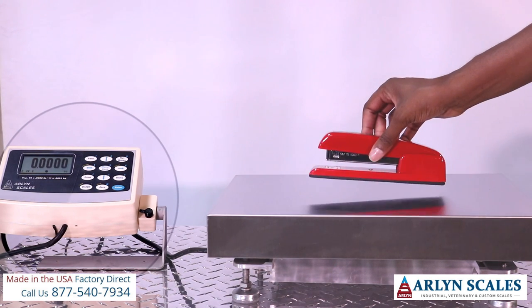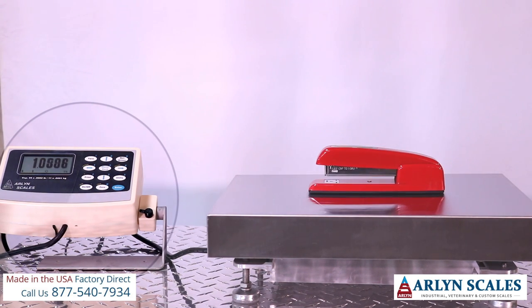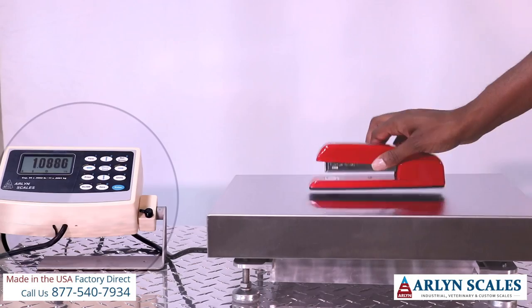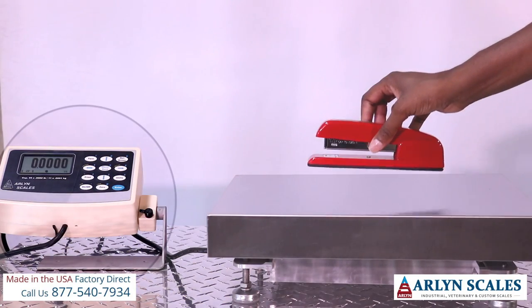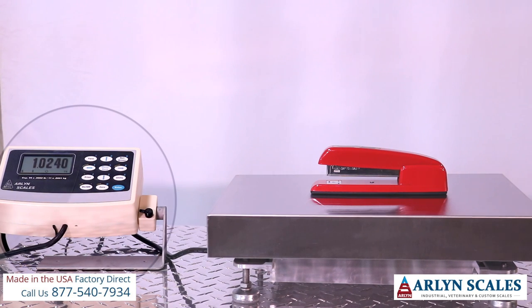Now it's the stapler's turn. There's our reading. Let's get rid of a few staples here. And as you can see it has registered the missing weight.